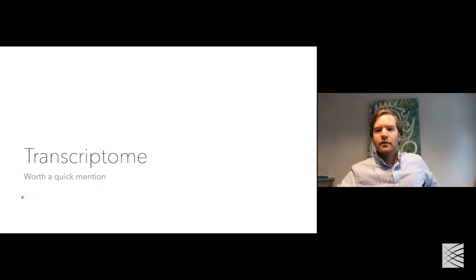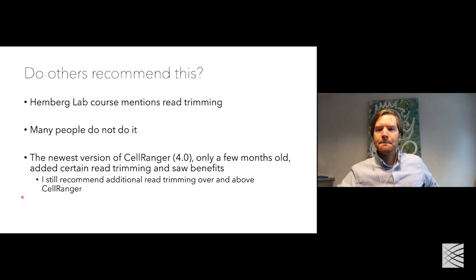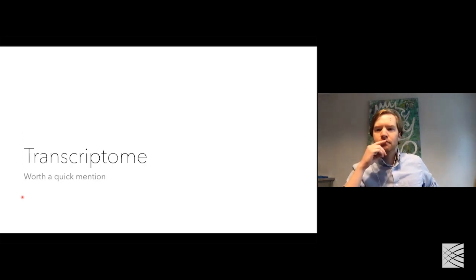Stephen, before you transition to the next slide, I just want to follow up with another question that I think comes back to this point about loss of information in terms of sampling only a subset of the molecules in a given cell. So the attendee asks, what biases exist, for example, most widely expressed mRNA or cell types, et cetera, that are compensated or potentially not fully compensated by efforts to process the data?